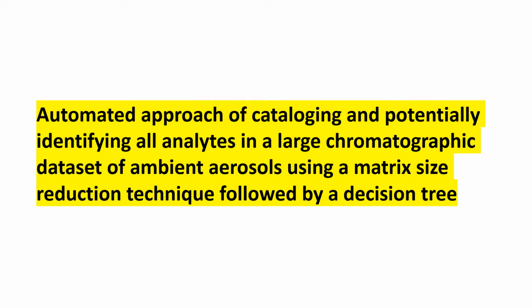Here, we present an automated approach of cataloging and potentially identifying all analytes in a large chromatographic dataset of ambient aerosols, using a matrix size reduction technique followed by a decision tree. This approach can greatly increase the speed and accuracy of the analysis.